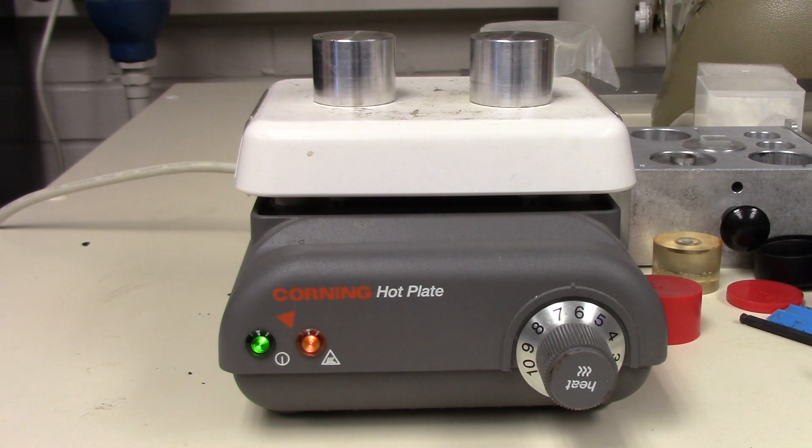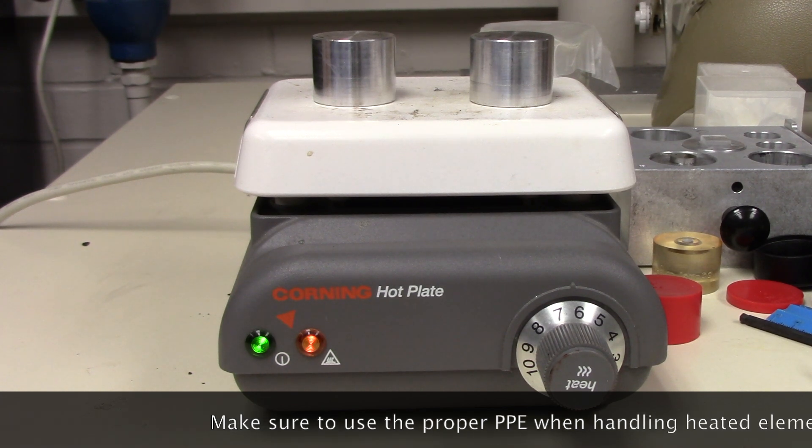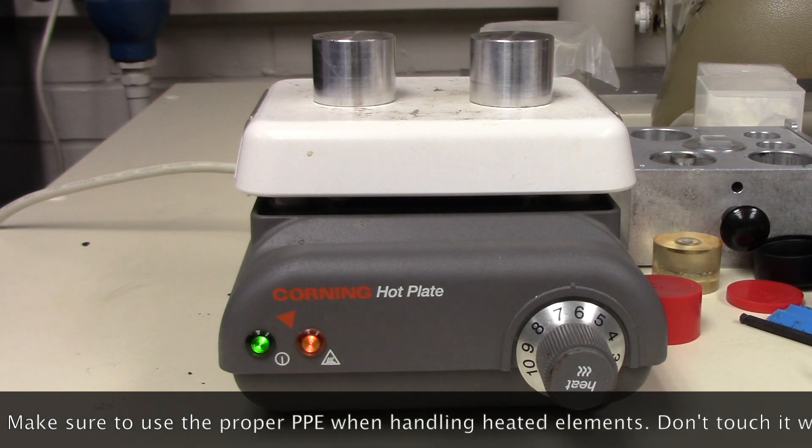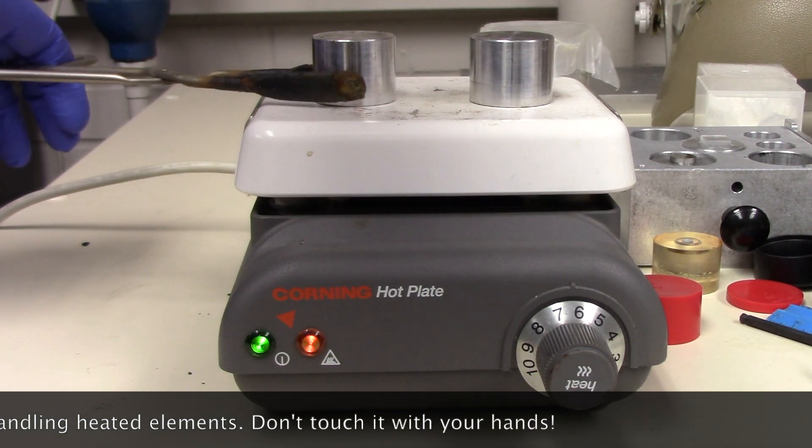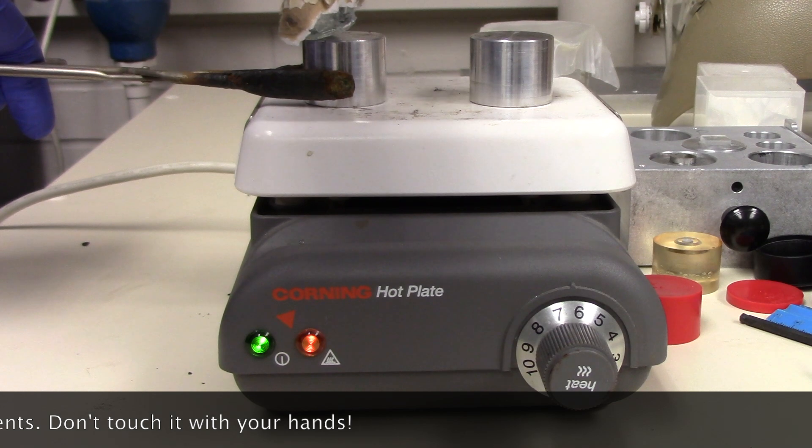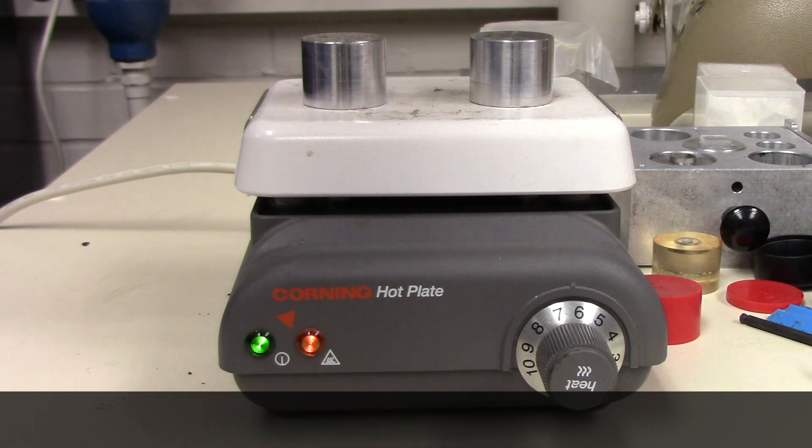To start off, you'll want to heat a sample stub that looks like this to about 70 degrees Celsius. So, on this hot plate here, it's about 6 or 7. And since I've been heating it for a little while, you just want to make sure that once it's heated that you take your crystal bond right here, grab hold of your sample mount, and then just put a small layer of crystal bond onto there.